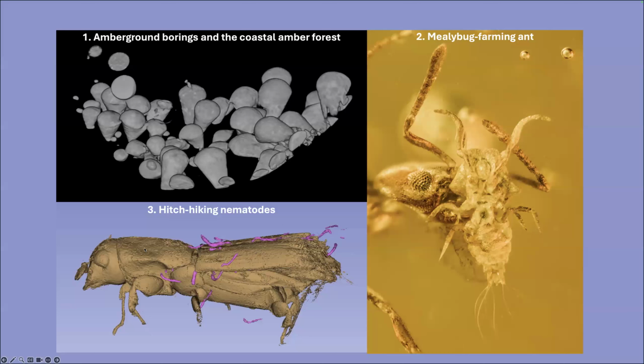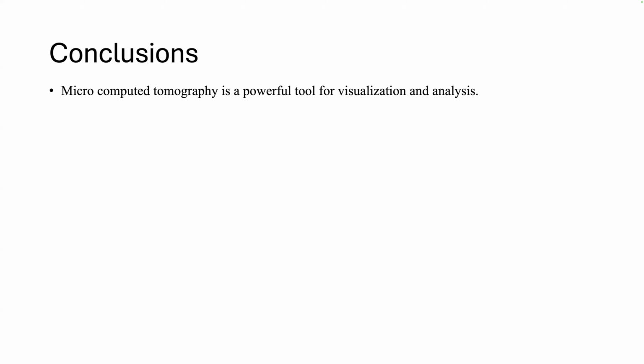So you go exploring. You think, what might I see if I look at that in 3D? And sometimes the story doesn't change very much, but you can greatly enhance the images that you've made. So, conclusions. Hopefully you'll agree, microcomputed tomography is a very powerful tool for visualization and analysis.